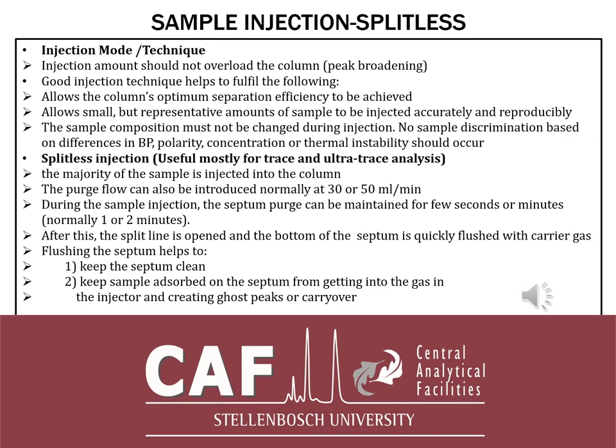Splitless injection, under the injection mode or injection technique. When one does the splitless injection, everything that you inject goes into the column, and then you get higher peaks, and it increases the sensitivity of your chromatography. And one uses SPME when you're working with trace and ultra trace.